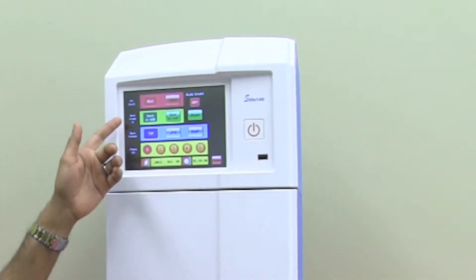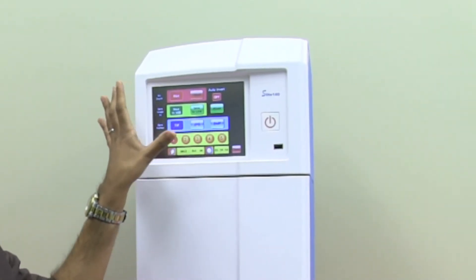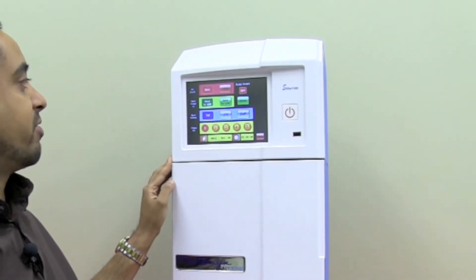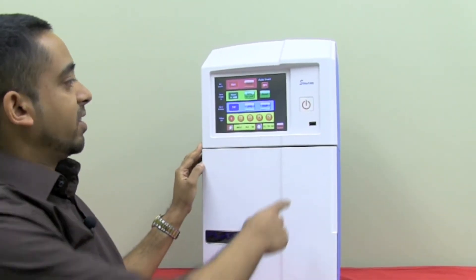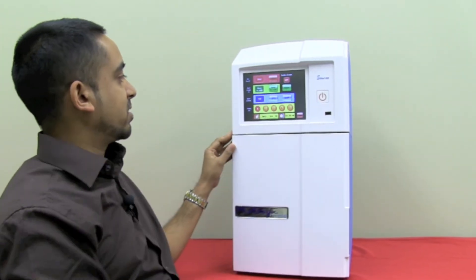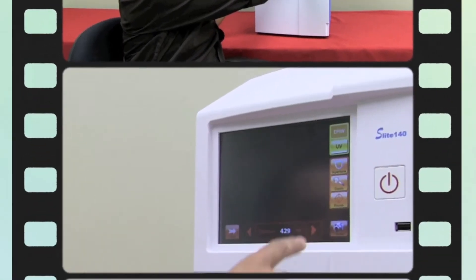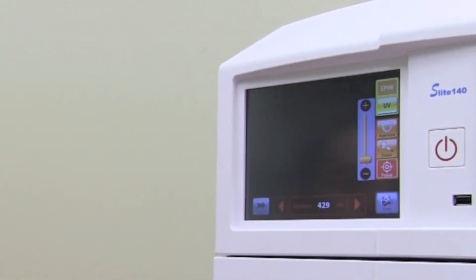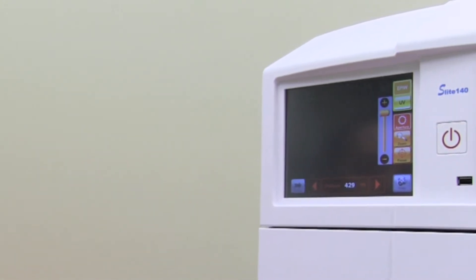Taking a look at the touchscreen display of the S140, we see there's a large 8-inch VGA full color display. We're in the preferences area of the OS here. You can set your bit rates, save to either USB or over the network via LAN. There are various image formats available, and you can also adjust your filters. You'll also be able to adjust your aperture, zoom, and focus. This is actually really quite responsive for a touchscreen system.